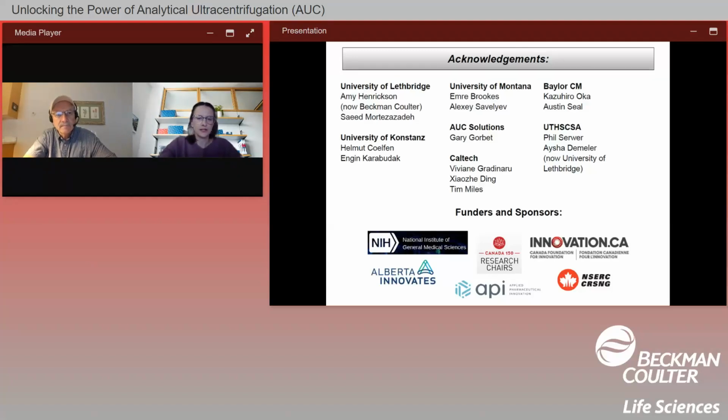Awesome, thank you. And ABDE also requires less sample as well, if that's a sample constraint, which is one of the benefits of the buoyant density equilibrium.